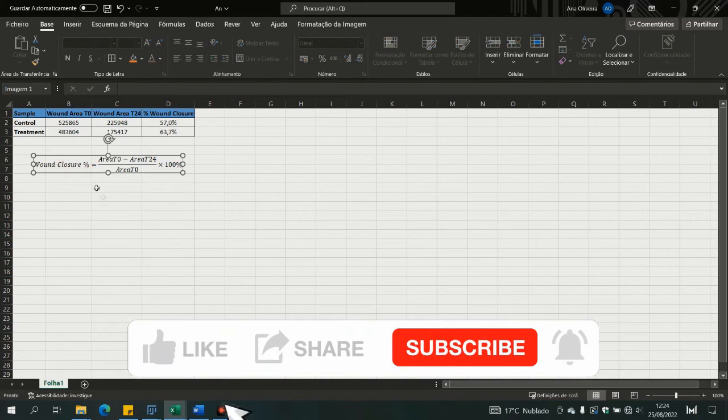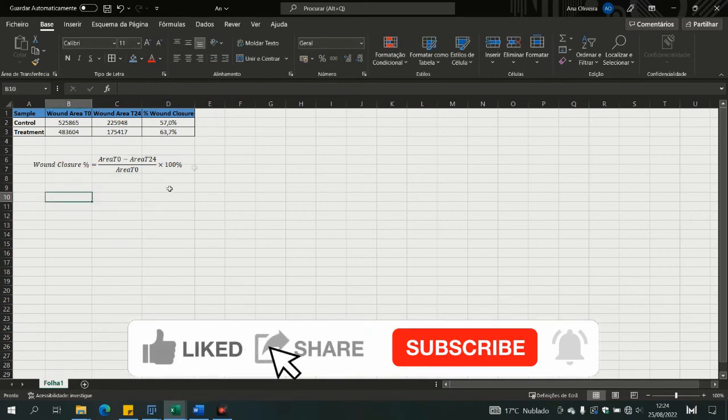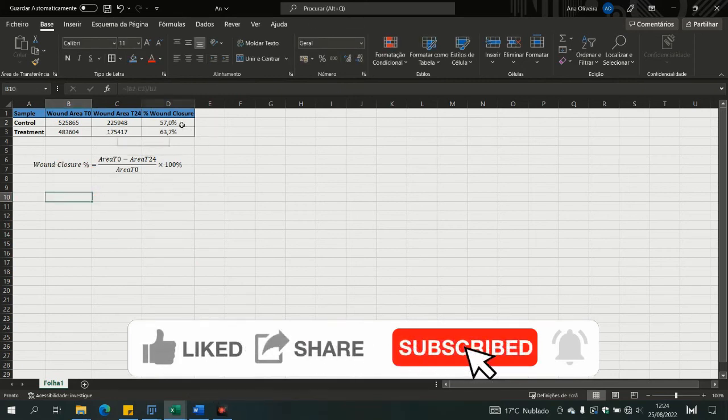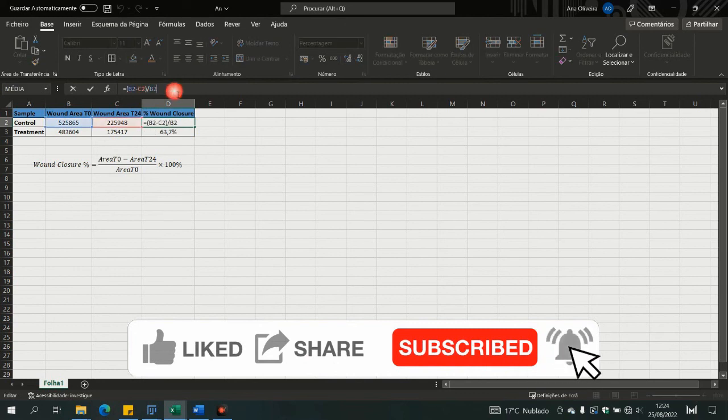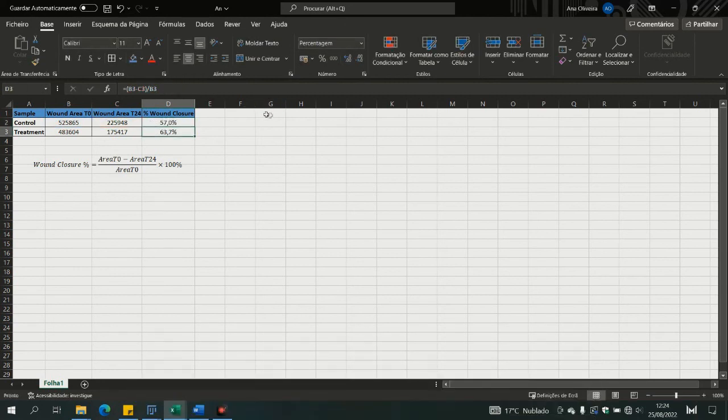Once you have the value of the area of the wound in the beginning and the end of the treatment, you can apply this formula to calculate the wound closure percentage of the compound that you use.